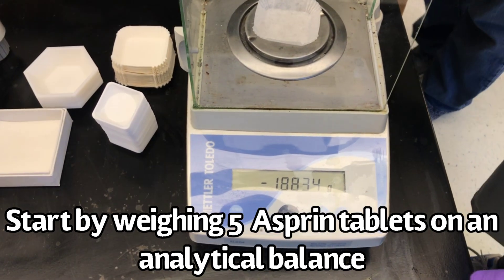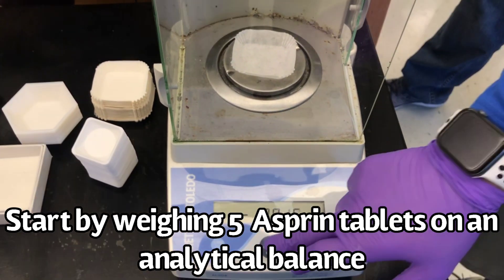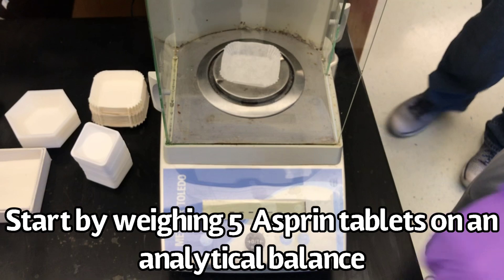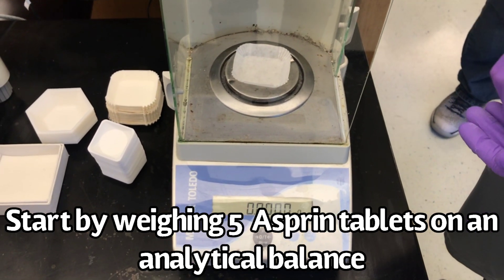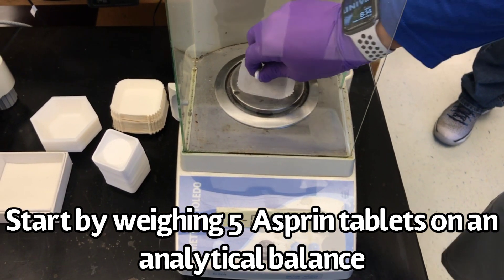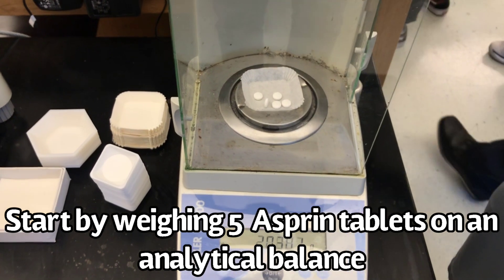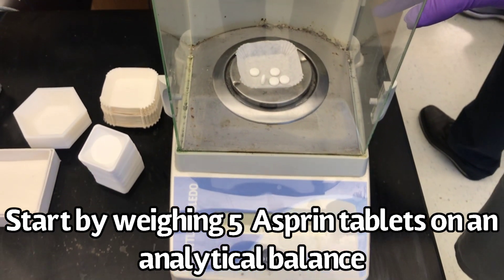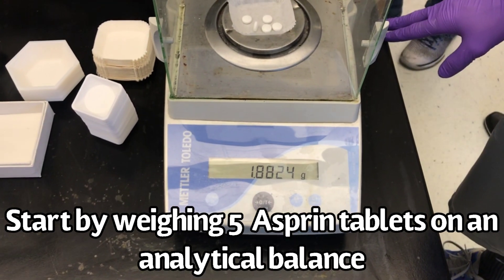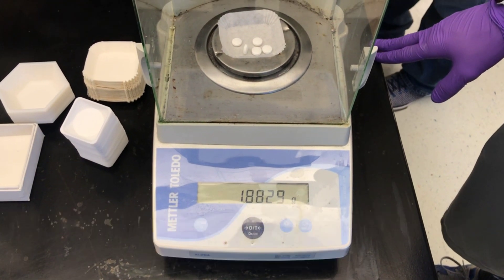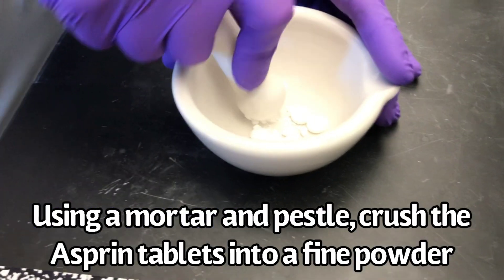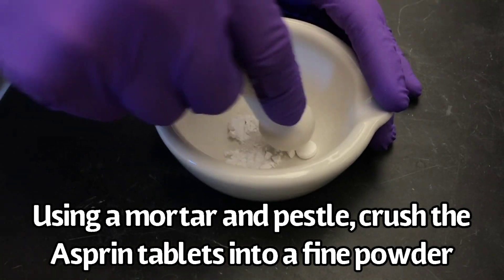Start by weighing 5 aspirin tablets on an analytical balance. Use a mortar and pestle to crush the aspirin tablets into a fine powder.